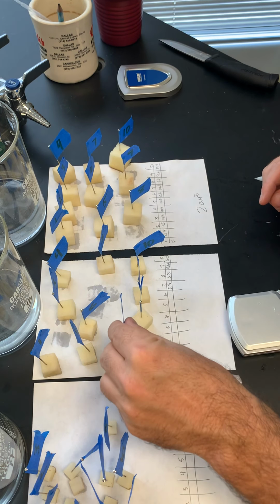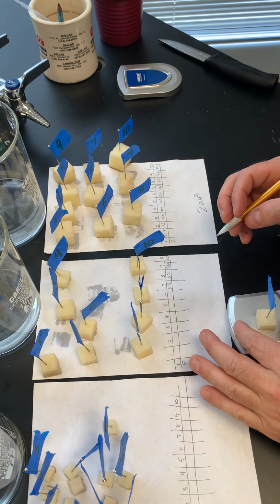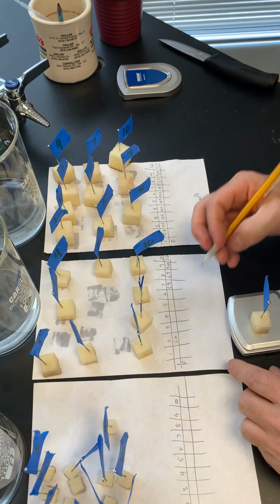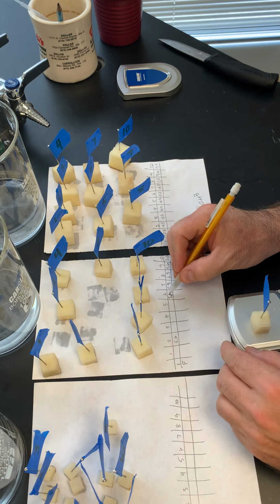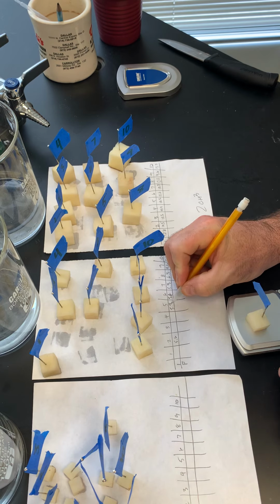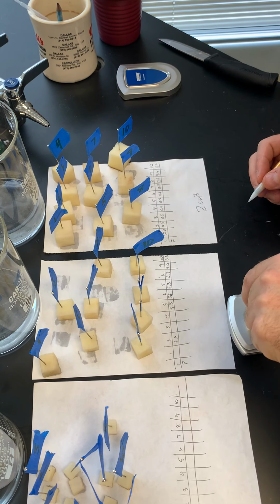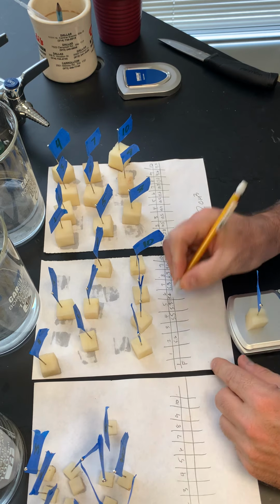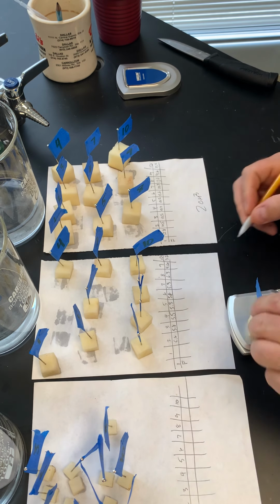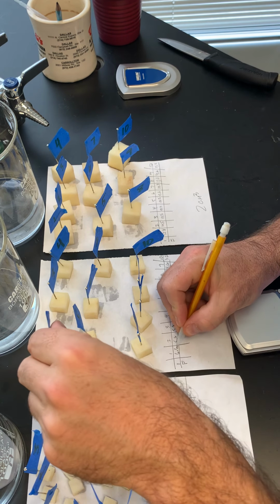Actually, that's not, okay. This is 2, put it in the right location. 5.6, 6, 5.4, 5, 5.3, and 4, 5.5, 3, 5.8, and 1, 6. So these are, and my units are grams.